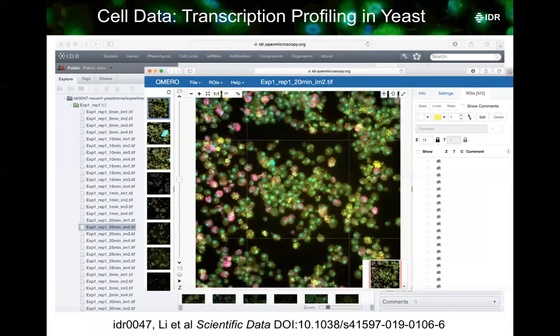If you select one of the images, it will open up in the iViewer, and you can see that it has many regions of interest. When you click on Show, you'll see that this image has 372 individual masks, and you can deselect or reselect the mask you wish.